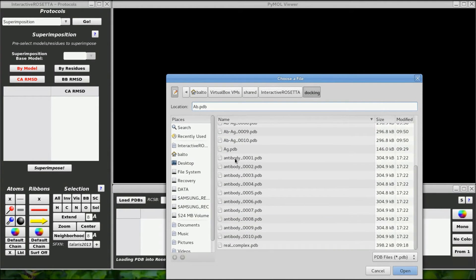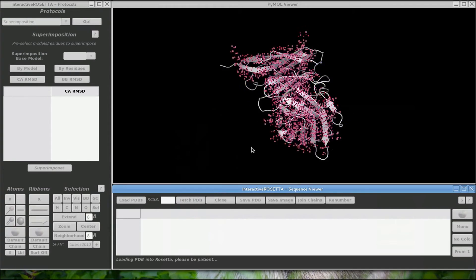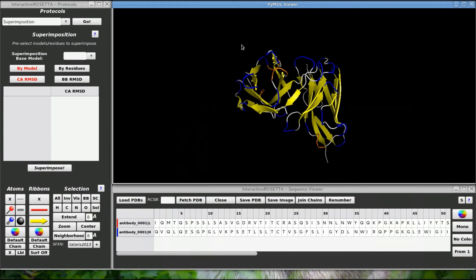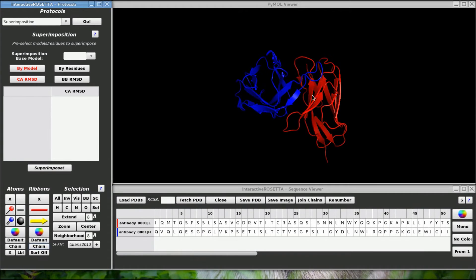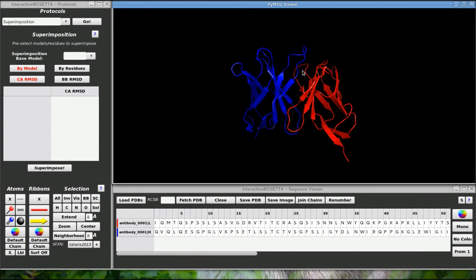Here is what the first structure looks like. Looks like an FV structure to me. I also received an ensemble archive containing these 10 models.